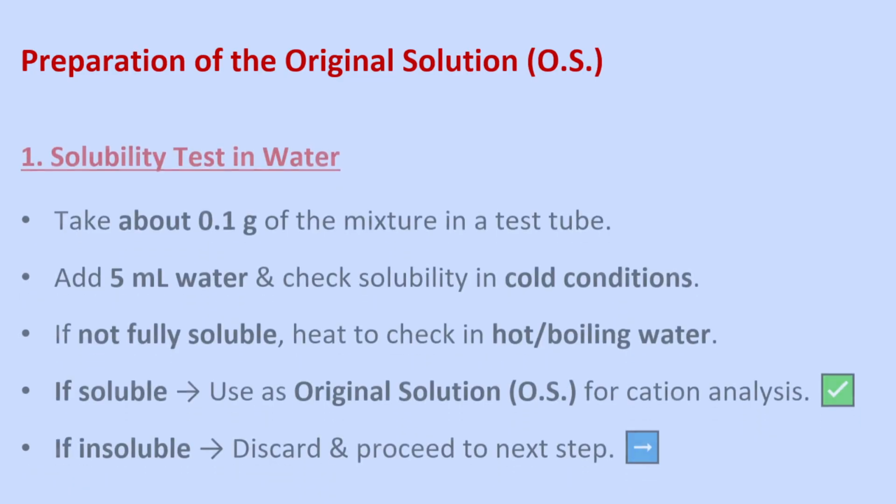Preparation of the original solution. Let us discuss how to prepare the original solution, or OS, for qualitative analysis of basic radicals using the solubility test.